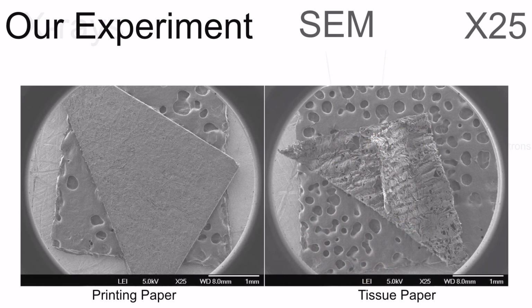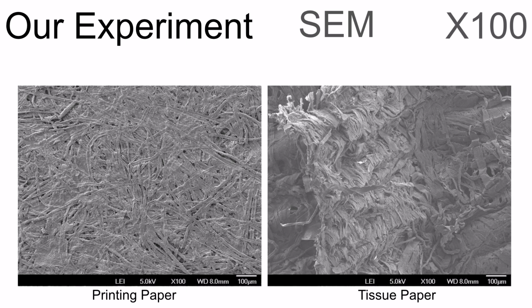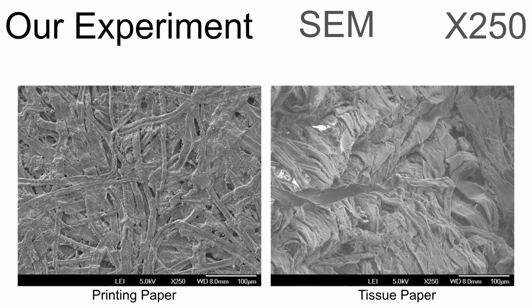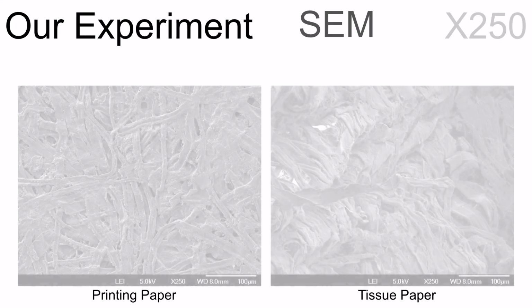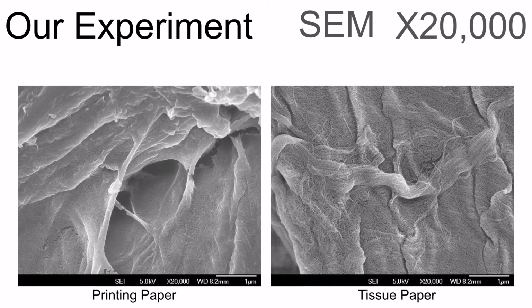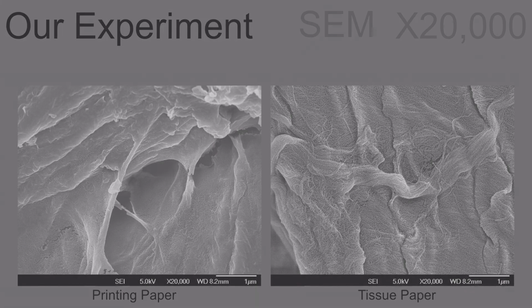In the present experiment, we examined and compared the nanostructures of tissue paper and printing paper. From analysis of SEM images, it is clear that printing paper has made more liberal use of adhesives than tissue paper, such that plant fibers are more difficult to distinguish. In tissue paper, the plant fibers retain more three-dimensional structures and are more likely to have come loose from the surface. As the fibers on tissue paper are more loosely bound, the paper is much more porous and has greater surface area for the adhesion of water molecules. These features contribute to the greater absorbing properties of tissue paper over printing paper.